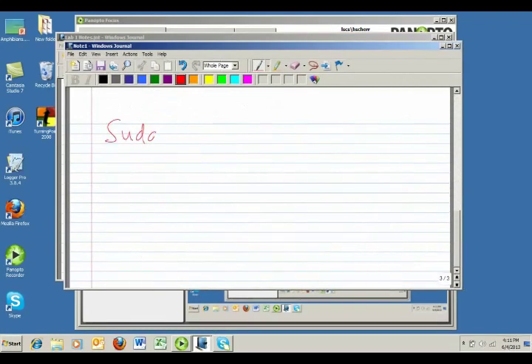Sudan is capitalized. It's actually named after the country. The Brits, when they're naming different stains, really like to name them after exotic locations in their view. So Sudan-3, we have like Congo red and things along those kinds of lines. And so it really was named for the country because it was a pretty beautiful exotic color. So it's a red color, which will accumulate and turn the lipids orange.